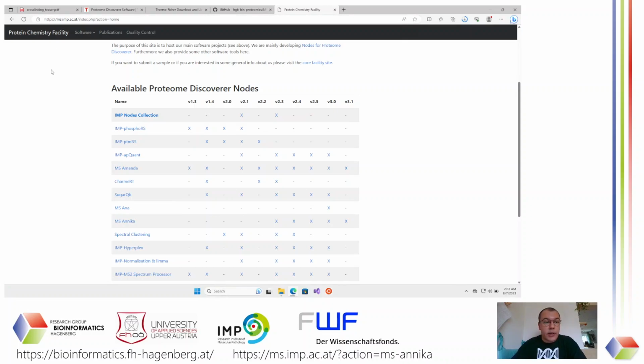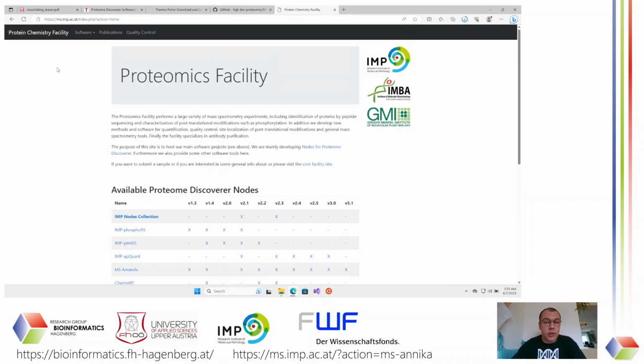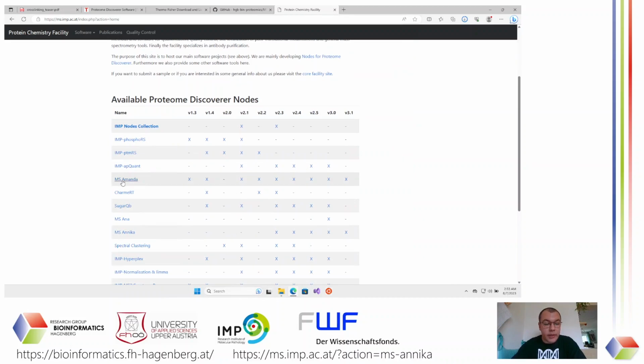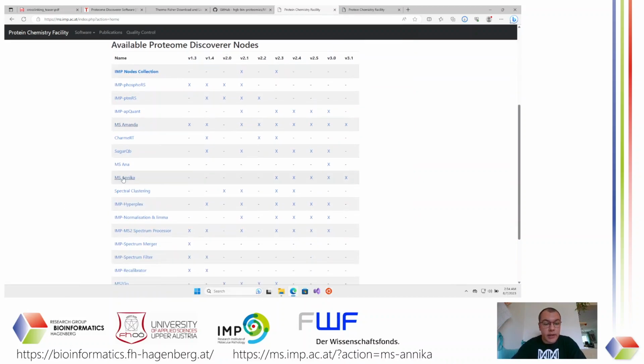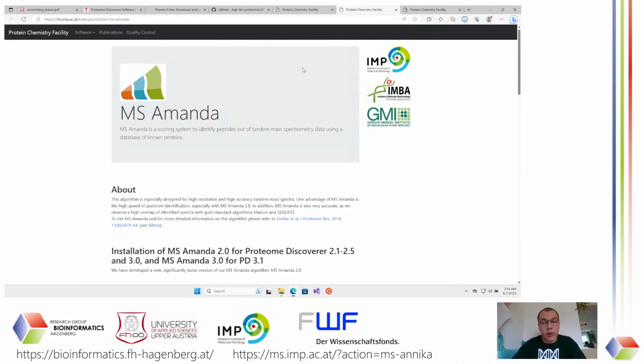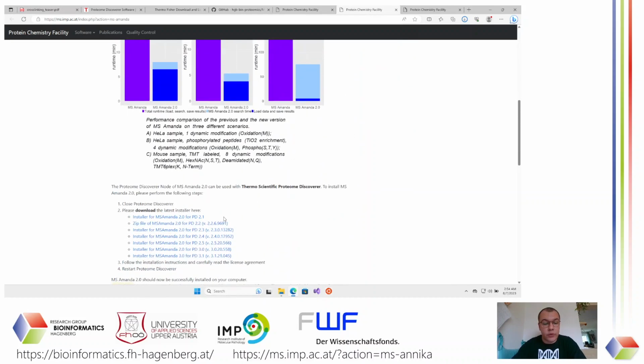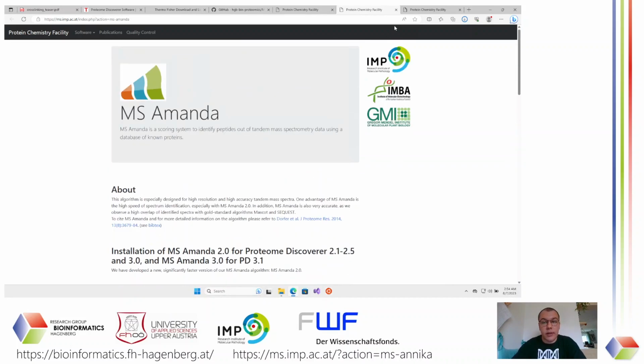If you go to the address ms.imp.ac.at, you get to the website of the proteomics facility, and there you will find both the website for MS Amanda, which you can open, and the website for MS Annika. So in case you're not downloading the third-party nodes, I would recommend downloading the newest MS Amanda version for Proteome Discoverer here. But since we are downloading the third-party nodes, I'm going to skip that.